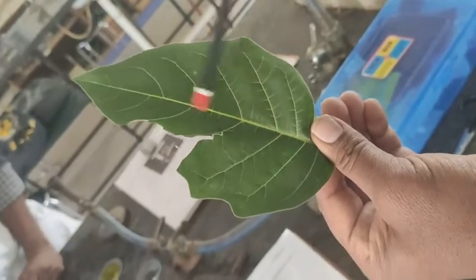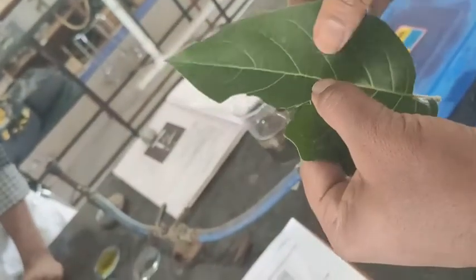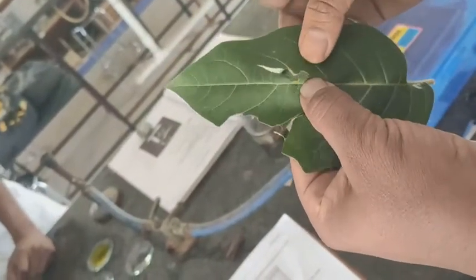Then you have to cut the section in this way. You have to cut it properly. This is about your section.